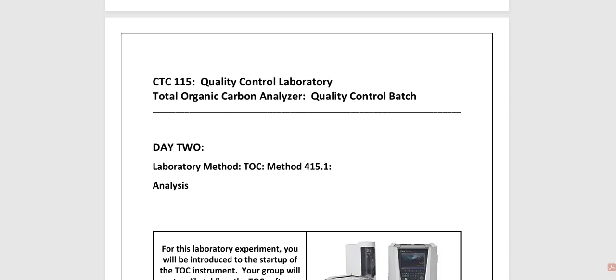And once more, if you've been paying attention in the lecture videos, the TOC is actually not total organic carbon. That is a lie, and that's because we focus on NPOC instead. And the NP is non-purgeable. That is what this is after. So anything that can be purged out of the sample is going to go away through the bubbling of 1.5 minutes into the process of the sample processing and technique that we're doing.